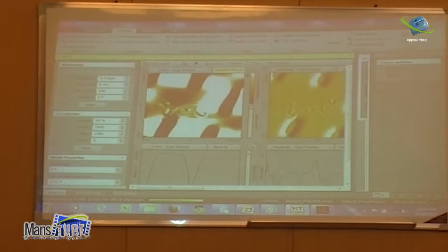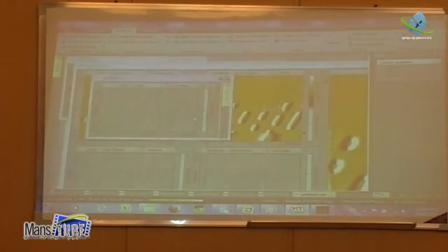That's it. I want to take a cross section here. This is the line, and this is the first line, like this, and this is the second line. Right, go here. This is from here to here. Let's say the total area is about 160 nanometers. So this is including the scratching inside and the material out. Okay.